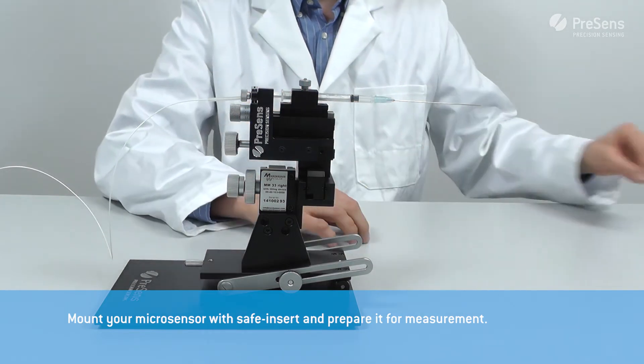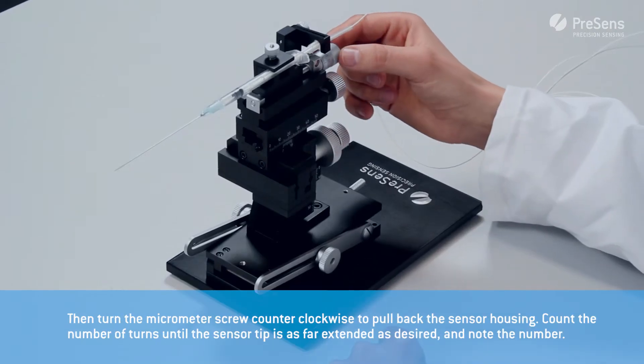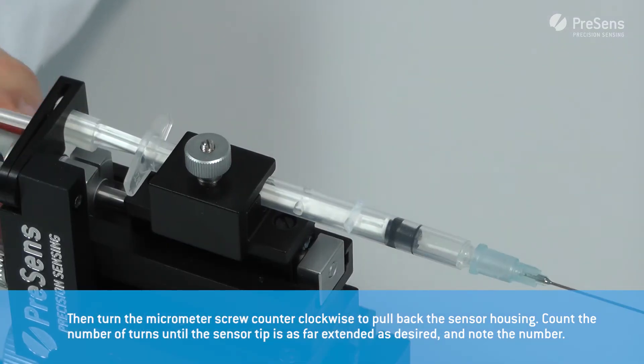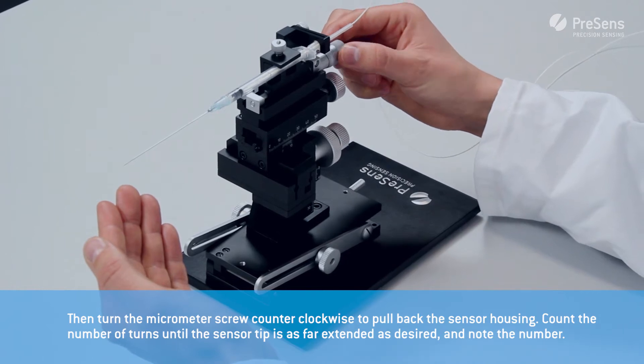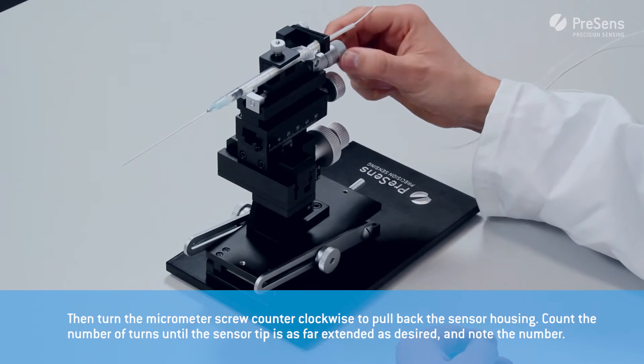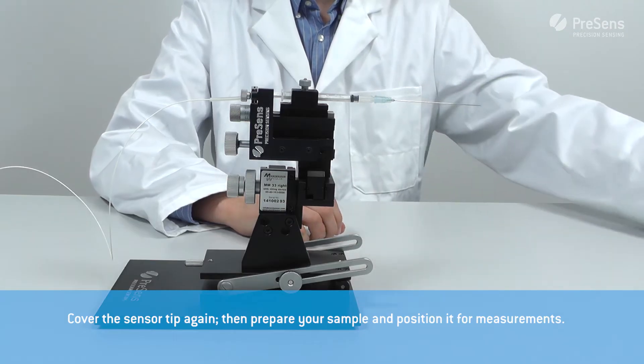Mount your micro sensor with safe insert and prepare it for measurements. Then turn the micrometer screw counterclockwise to pull back the sensor housing. Count the number of turns until the sensor tip is as far extended as desired and note the number. Then cover the sensor tip again.